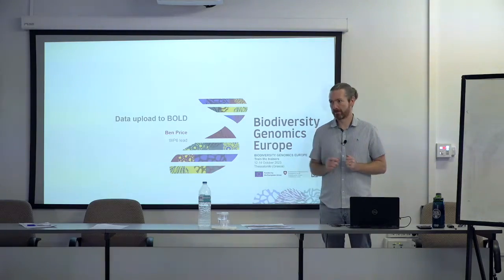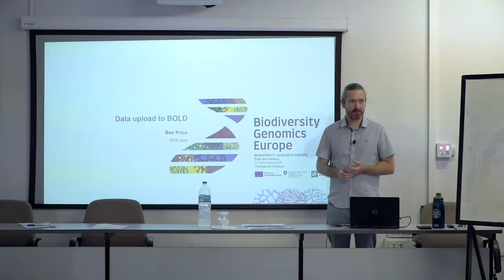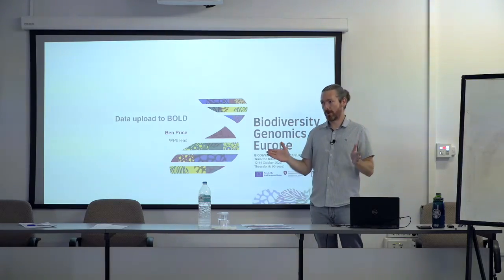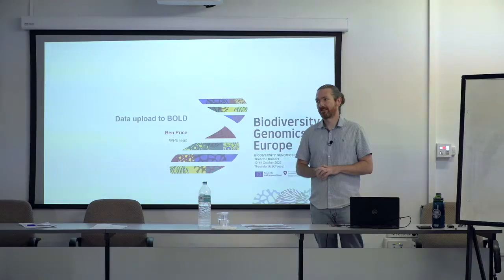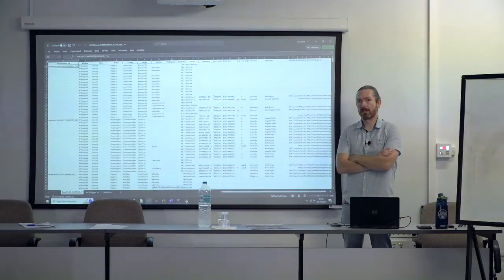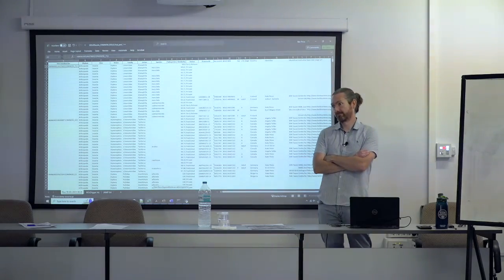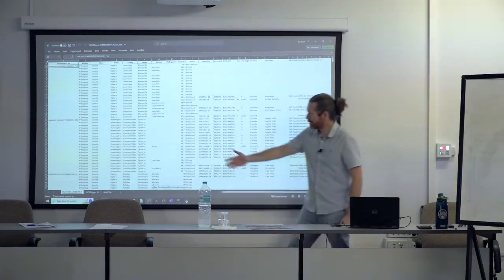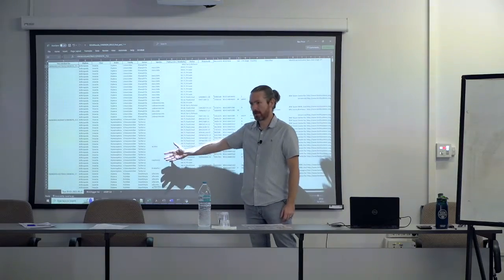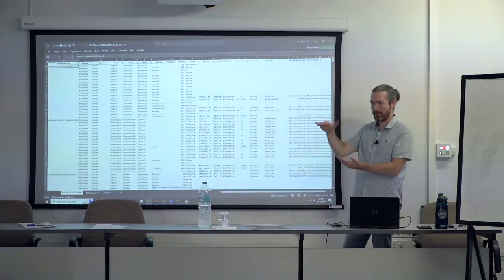Sarah, then Roya. Just take the functionality of this and stop doing the API queries. You know, they can do it locally. But BOLD's not a reference library, right? It's a workbench. If you want to make a reference library, take the data, play with it, and I guess the key is to make sure that the decisions you made are transparent, it's reproducible, and the underlying data is somewhere that someone could rerun it later. Because these matches a year from now will be different. Like the records might have different names. You know, there will be newer records in there. So that's one of the things, is that snapshotting, right?